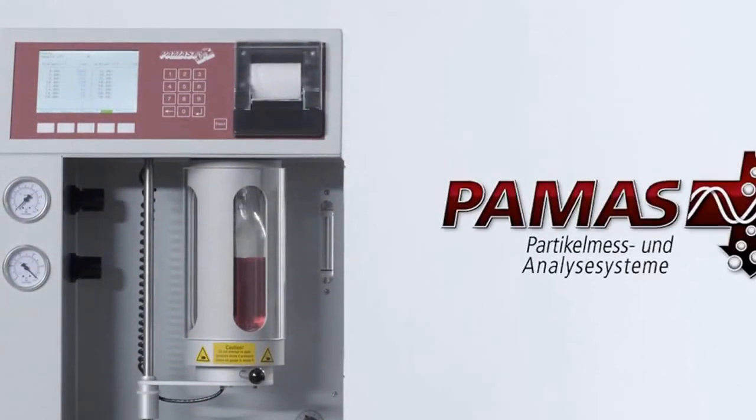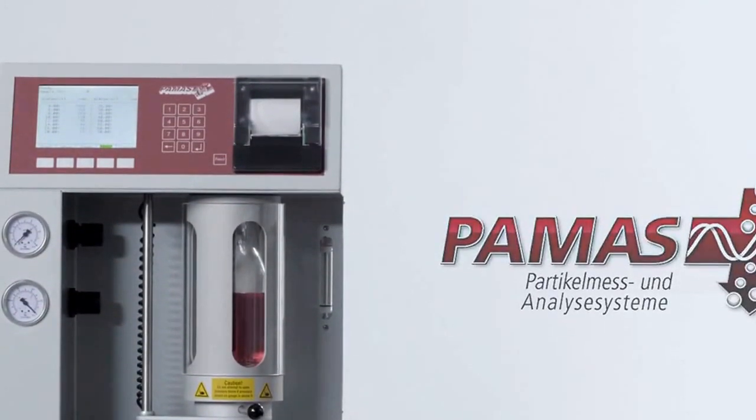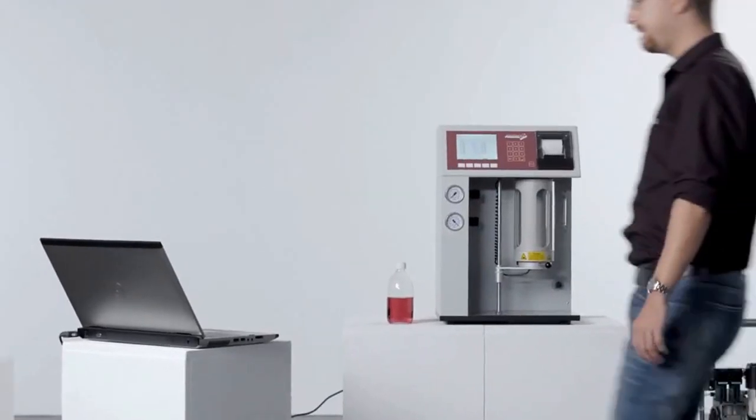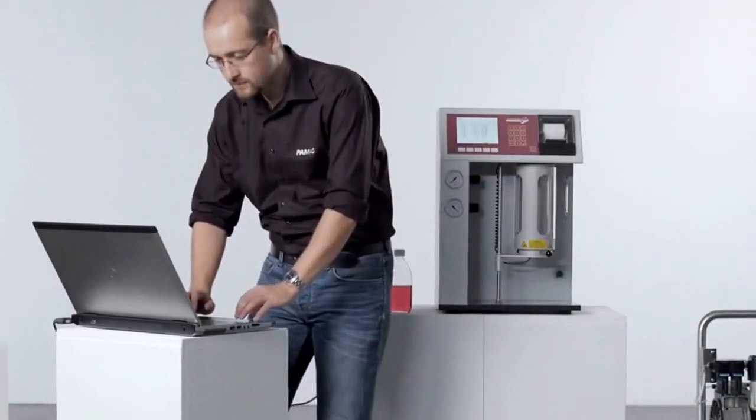The PAMAS SBSS Particle Analyzing System. A reliable and highly accurate particle counter for the analysis of various fluids.